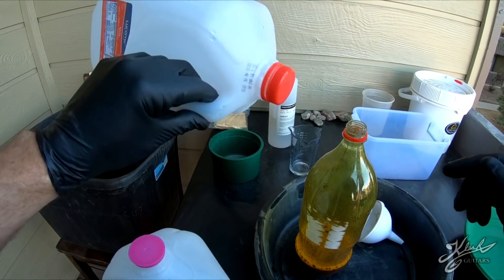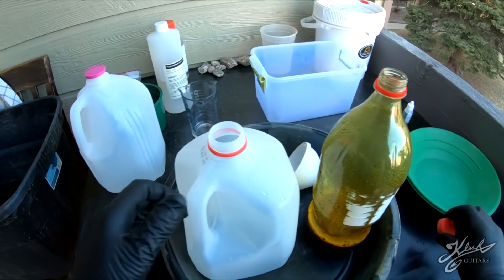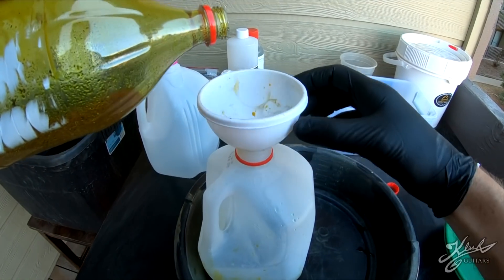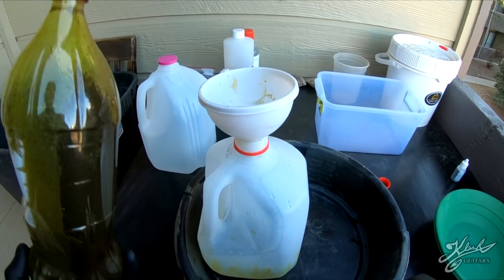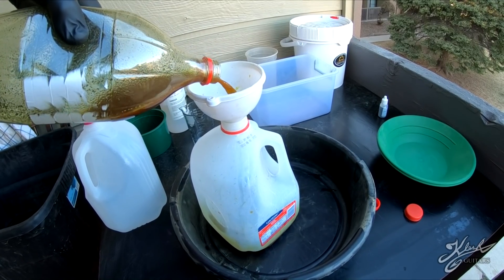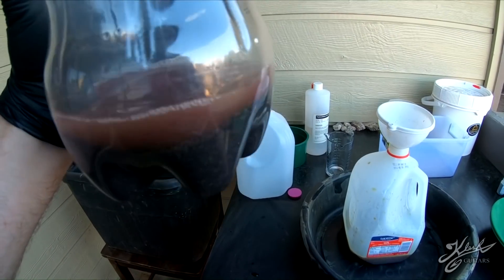Here we have a waste jug - this is just an empty milk jug. I'm going to go ahead and pour off all the liquids. Basically all we're doing is rinsing off this black sand. We'll do that again - you can see the liquid's getting a little bit less brown.